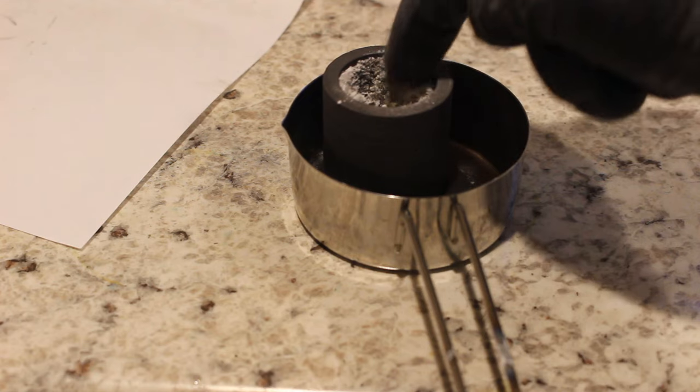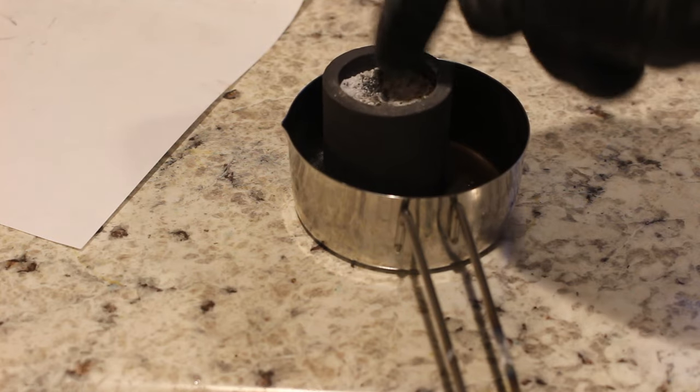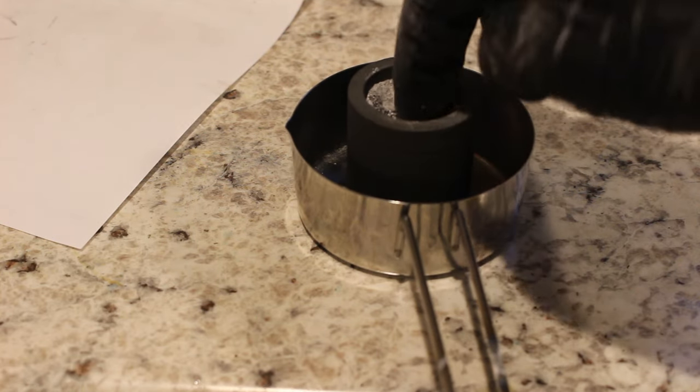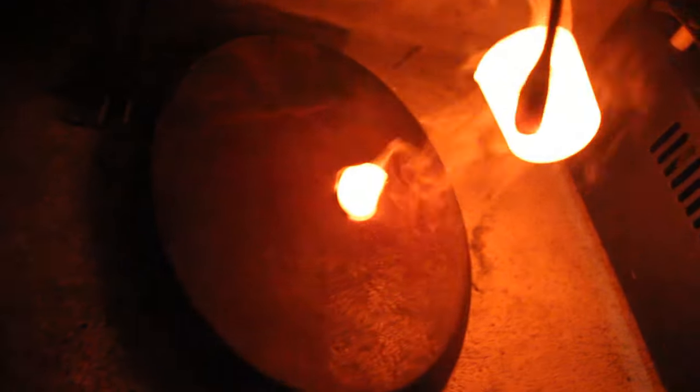I'm going to leave the lid open on this so it'll actually oxidize all that paper and hopefully the copper as well. That way we're left with just the noble metal. I didn't see any metal — well, hopefully there's some in there at all.